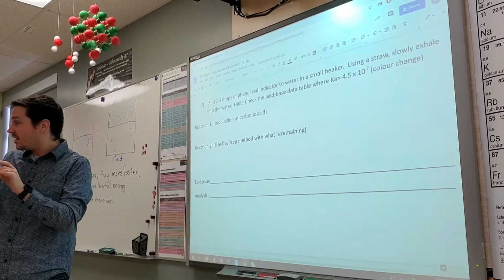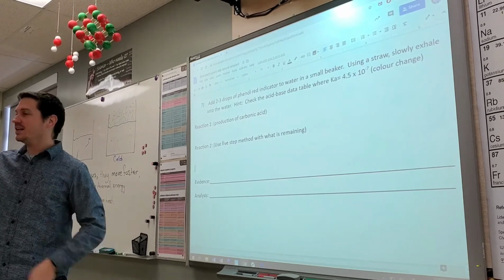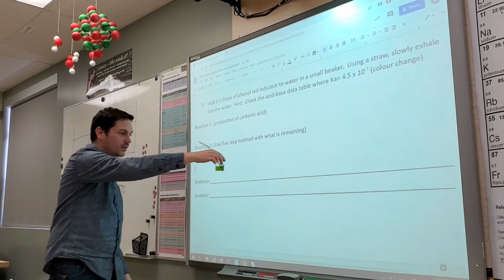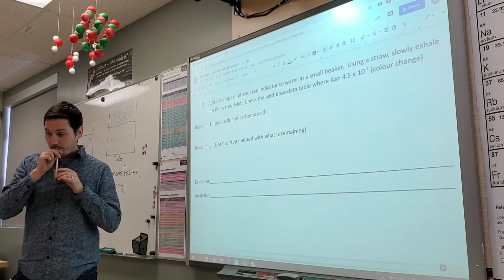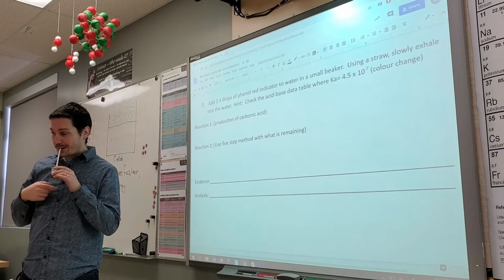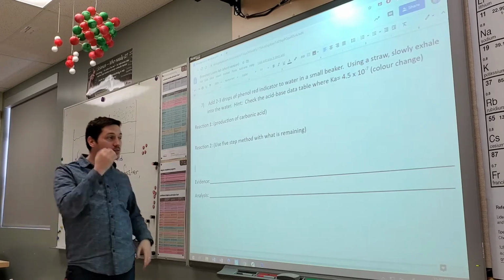That's insane! What's going on? What did I say bromothymol blue was in a neutral solution? Green. Is that kind of green? Yeah. Yes, okay. And if I kept going, what's going to happen? Getting light. Is it getting more and more yellow? It should be. No, whatever. Okay. But we observed a color change.